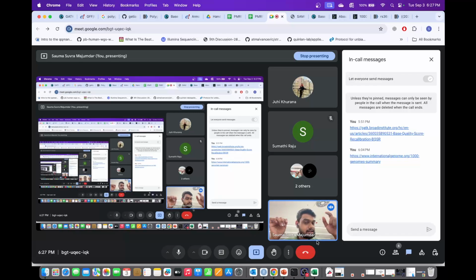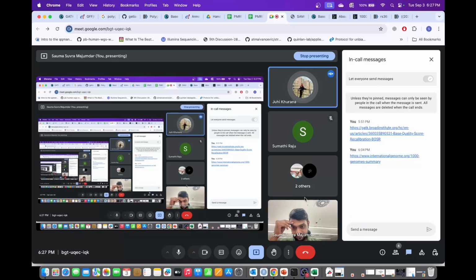If there is an exonic variant, there will be enough support for it anyway. So depending on your usage, I'll not say do not use it, but in some cases you might get away with not using it. Okay. So I use one more thing.